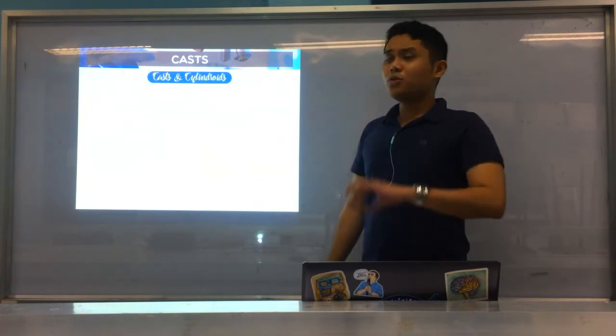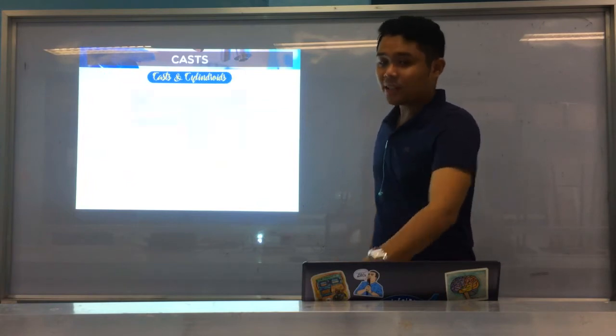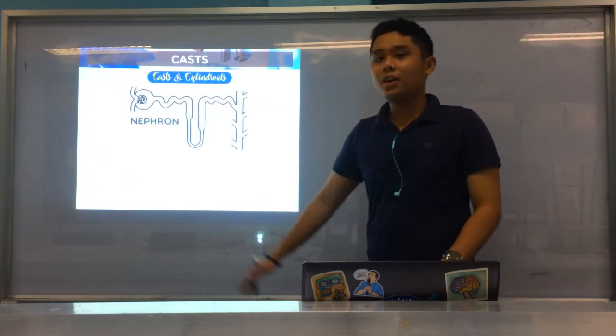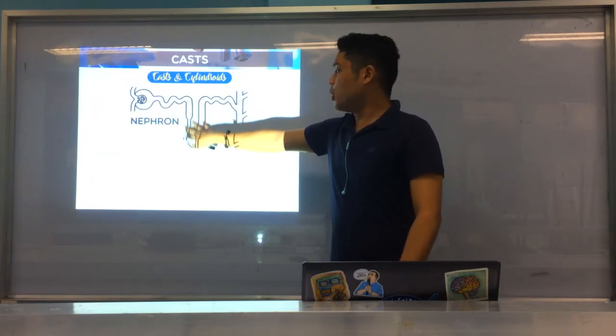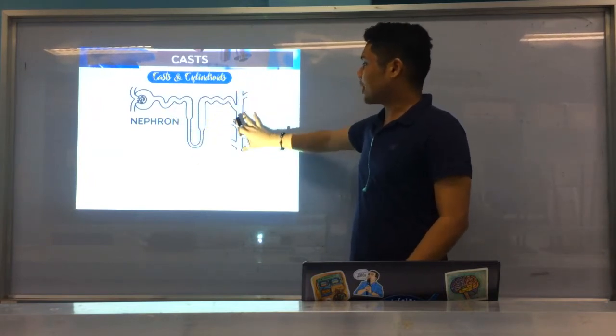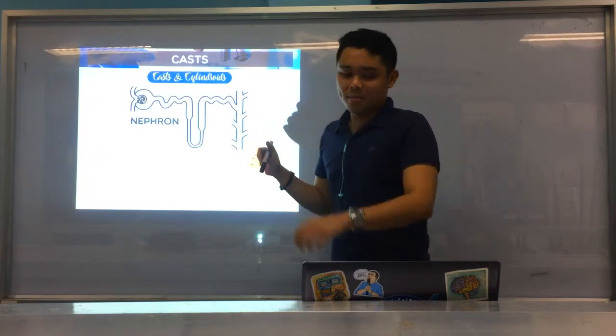Alright. Now, there's also what we call your cylindroids. Okay? Now, what's the difference from casts? The difference is just where they are created. Okay? So, here is again your nephron. As you can see, your glomerulus, the PCT, the loop of Henle, DCT, and then collecting duct. So, in a nutshell, that's your nephron, right?